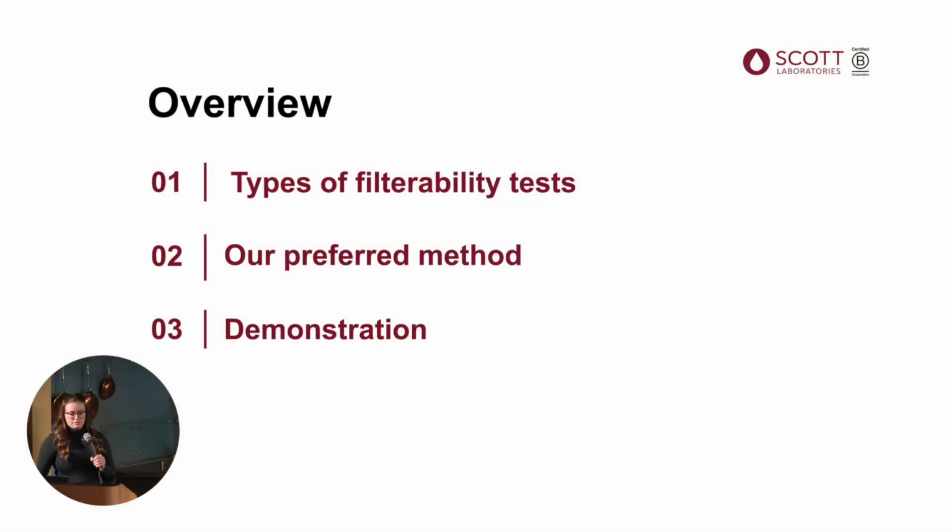Okay, so first I'm going to cover different types of filterability tests, and sort of intermingled with that, I'm also going to talk about our preferred method. And then Daniel's going to do the demonstration. So before we get started, how many people are testing filterability? Okay, awesome. You've made Daniel happy.